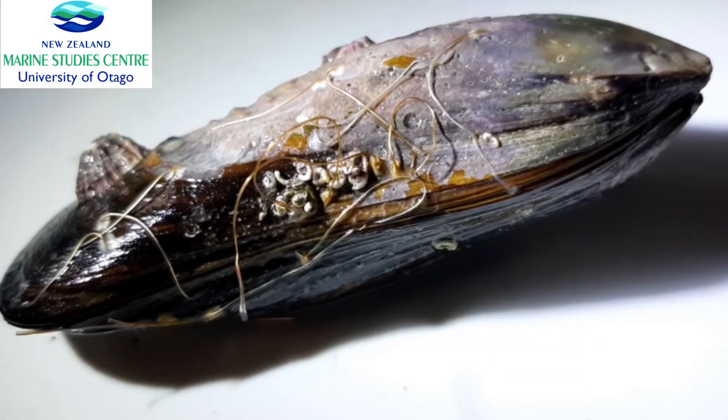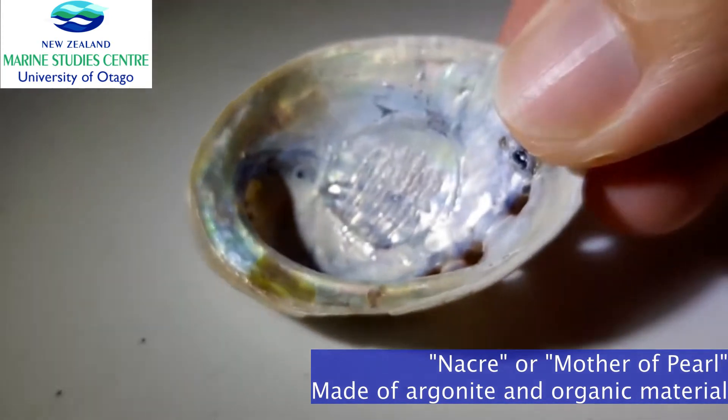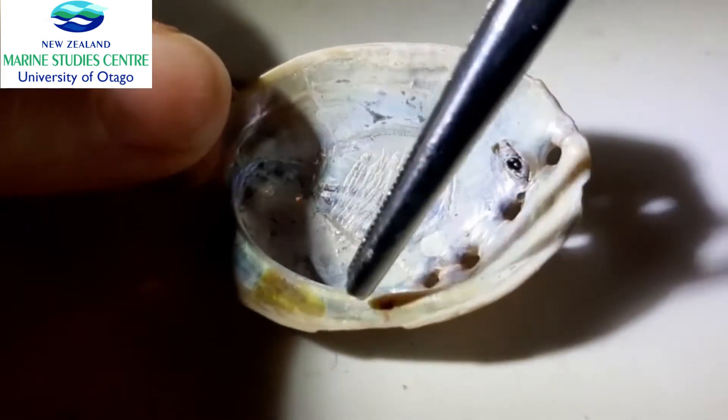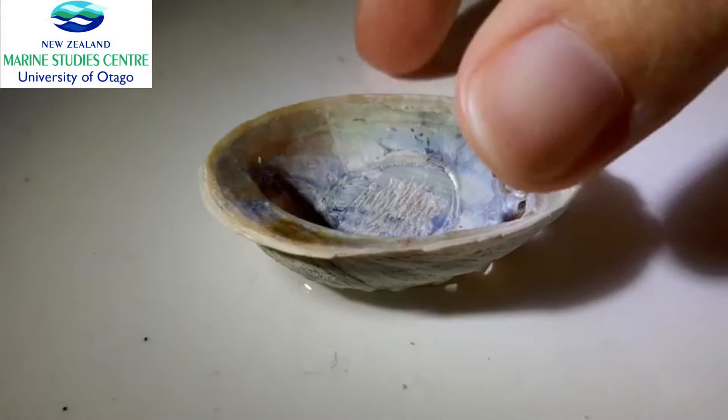The inner layer is something you might recognize from a lot of different shells, especially abalone. It is the nacre, or mother of pearl. I have an abalone shell right here so you can see this very glistening part — that is the inner layer of shells.